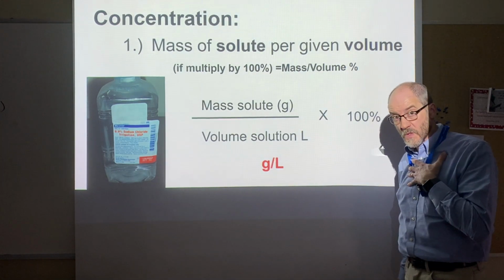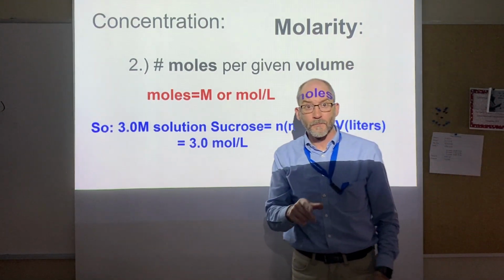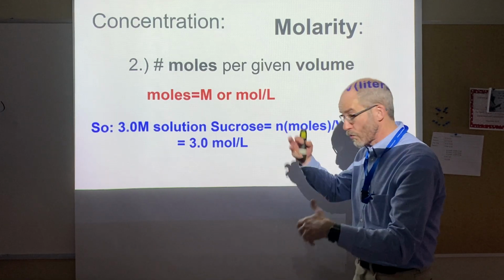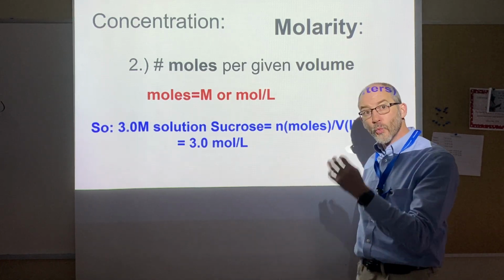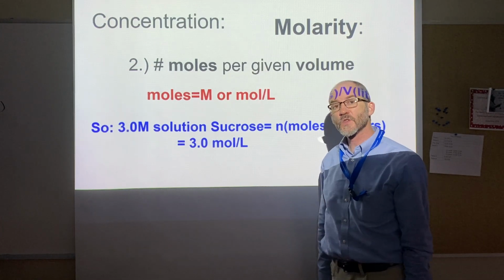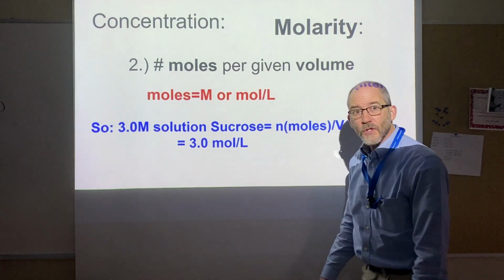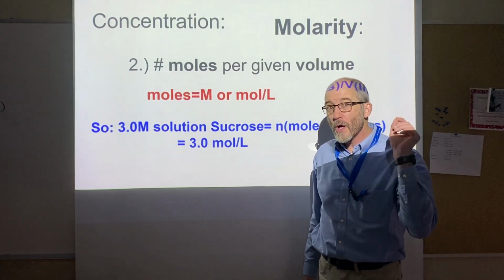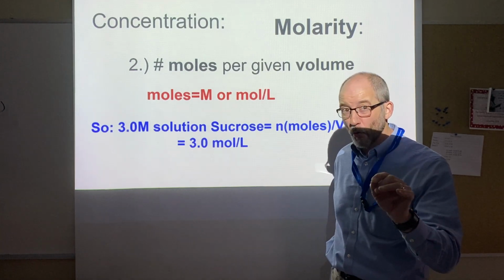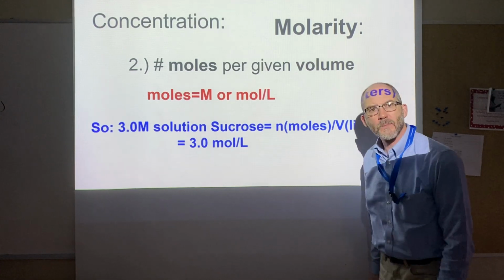What do I want to focus on today? Well, I want to focus on molarity. And I'll tell you why. It is not uncommon for you to do a lab in college or whatever, where you will be told that you need to use a solution that has a certain molarity. In other words, you might be told that you need to use 100 milliliters of 0.5 molar solution X. Well, okay, what does that mean?